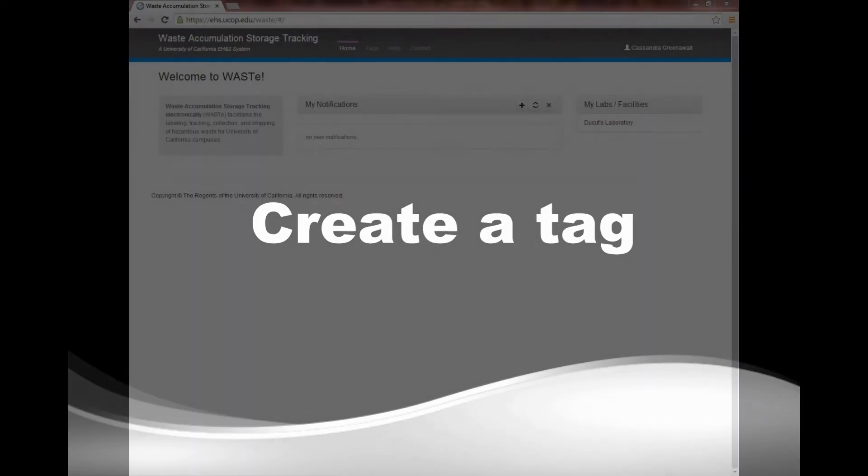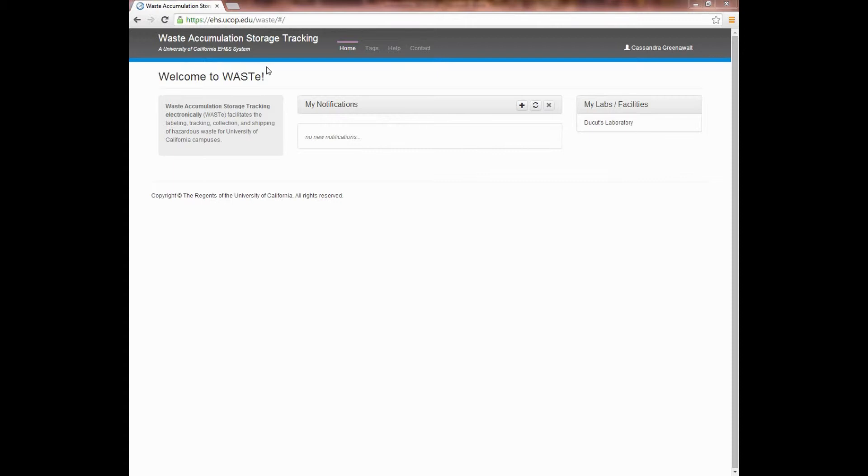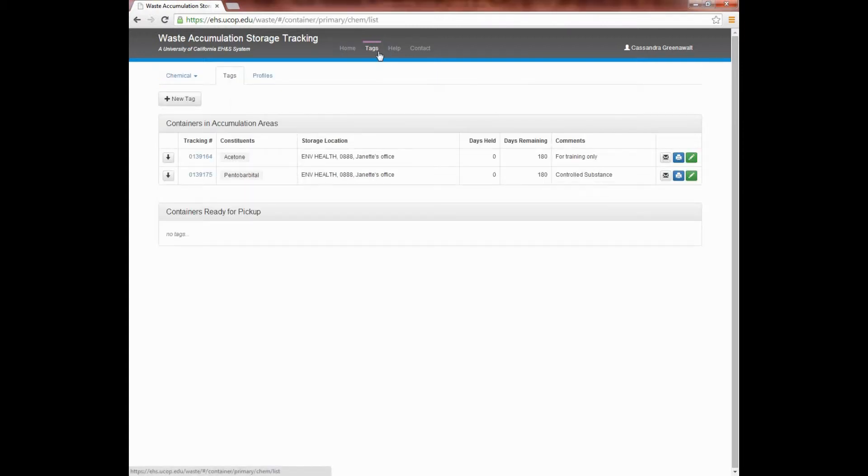A tag is the label that's affixed to a container before you begin generating waste. Authorized users can create tags for their assigned laboratory or facility. Before creating a tag, the location of your specific building and room must first be added by a responsible person or principal investigator. To create a tag, click on the Tags tab. Next, click on New Tag.